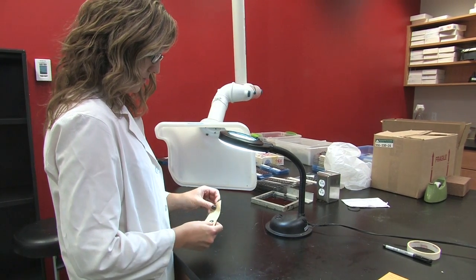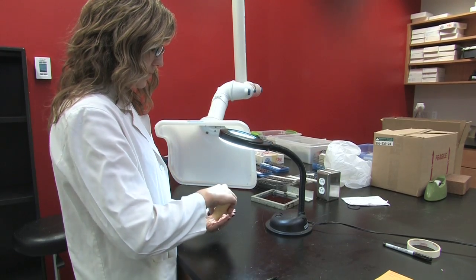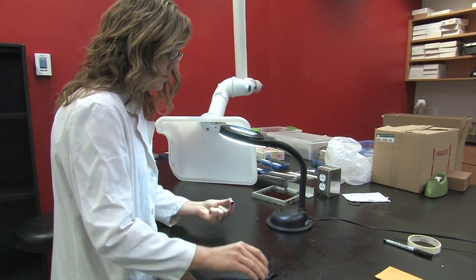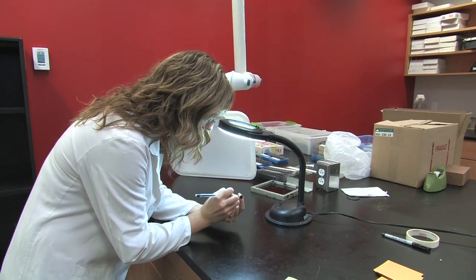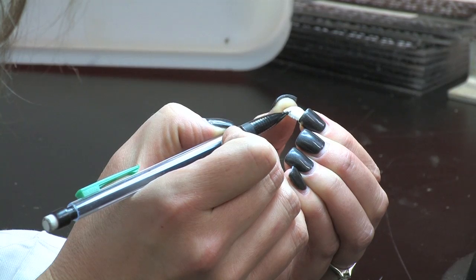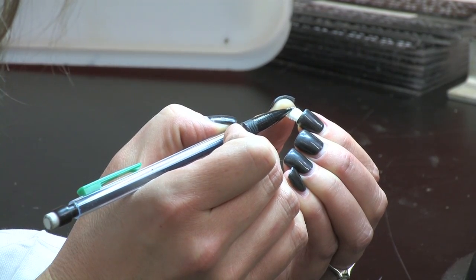Remove the otoliths from their envelopes and mark the cores. In this example we're embedding cod, so we look for a small bump on the sulcus side near the center of the otolith. The sulcus side is on the convex side of the otolith with the groove. Use a pencil not a pen to mark the core.